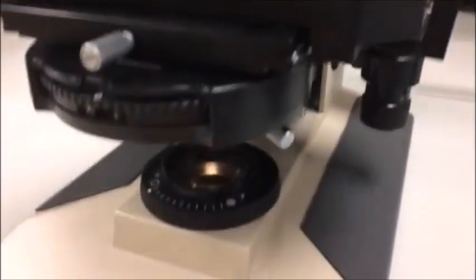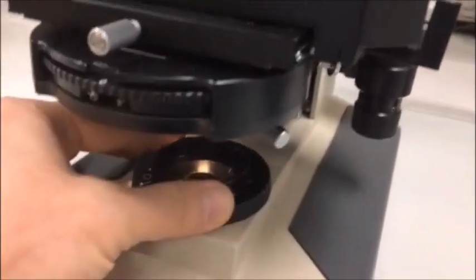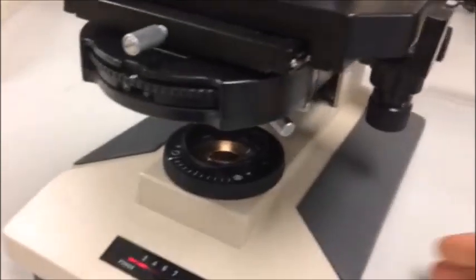So with the field diaphragm open all the way, which is clockwise, then you want to look through the objective lens and adjust the brightness of the rheostat until it is at a comfortable level.